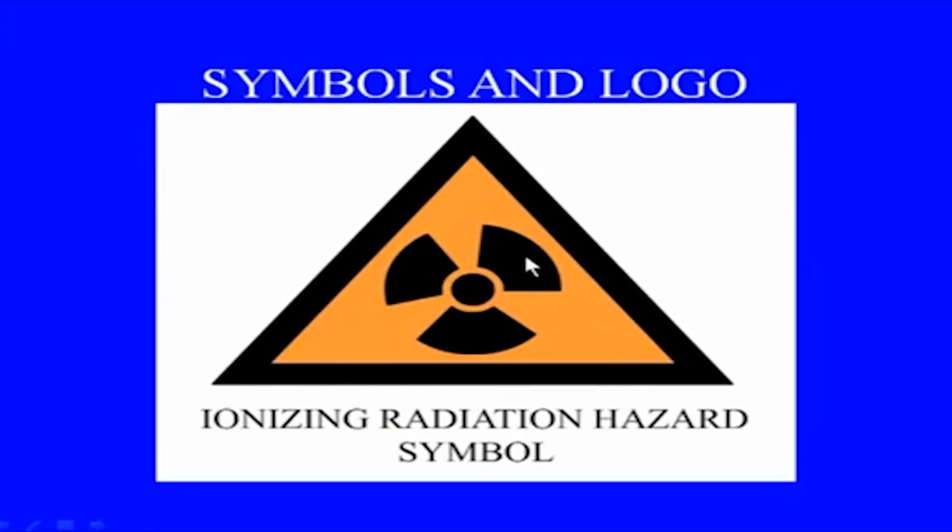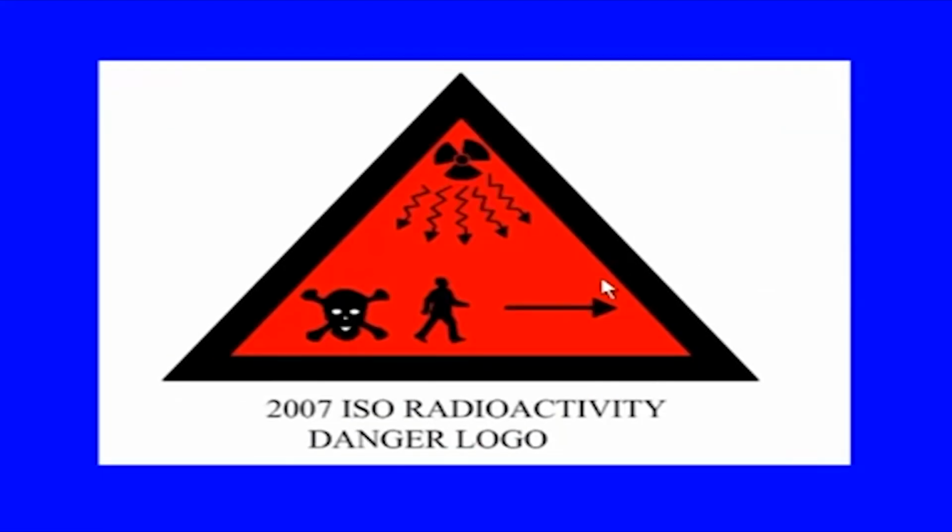Now, you can see these symbols here. This one shows the ionizing radiation hazard symbol, which could be pasted on the areas where work is going on, on the lab doors of the labs which are utilizing radioisotope techniques. There is another one, the radioactivity danger logo, which could also be pasted at the areas where radioisotopes are being used. So, these are two signs, and there are other signs also which need to be pasted, and people have to be alerted by proper danger signs where radioactivity is being used.